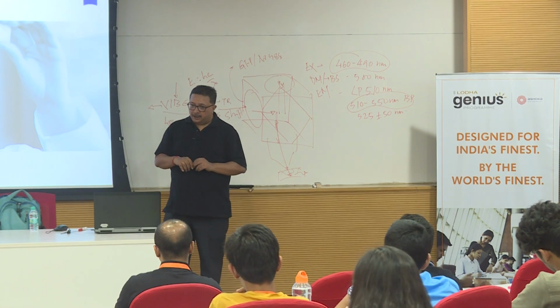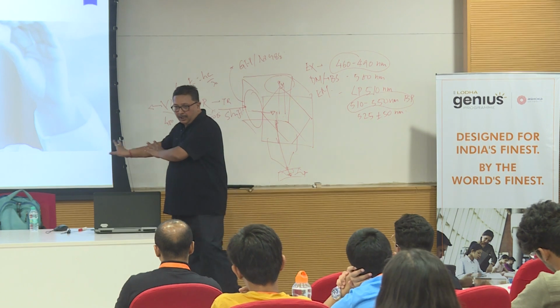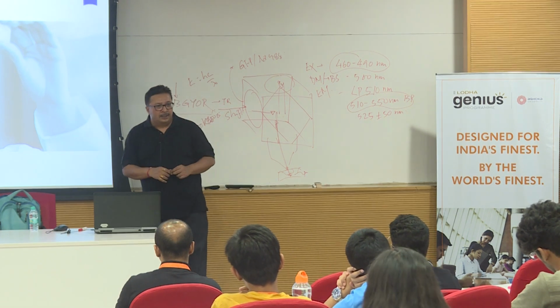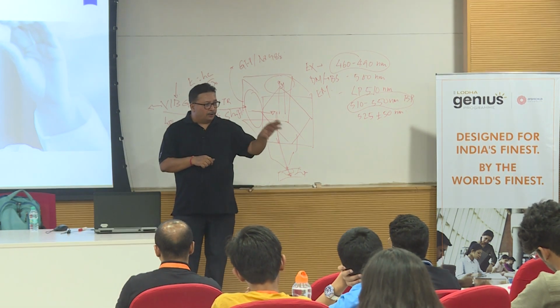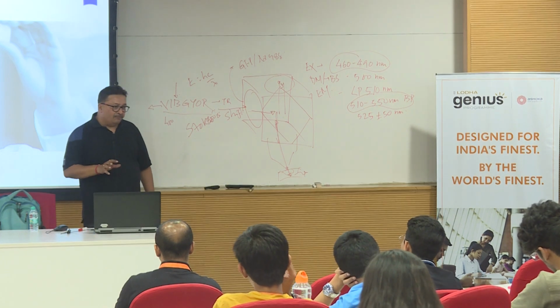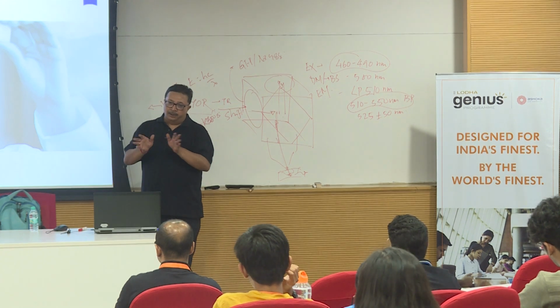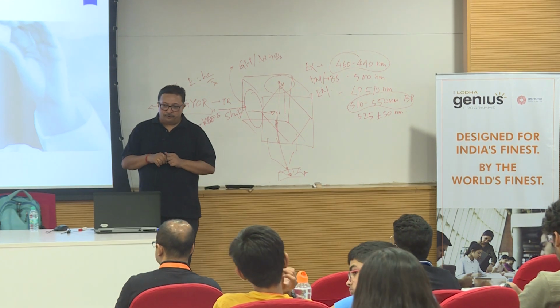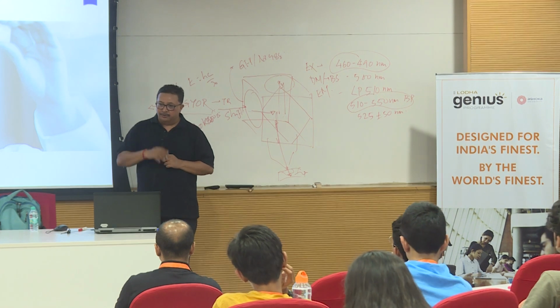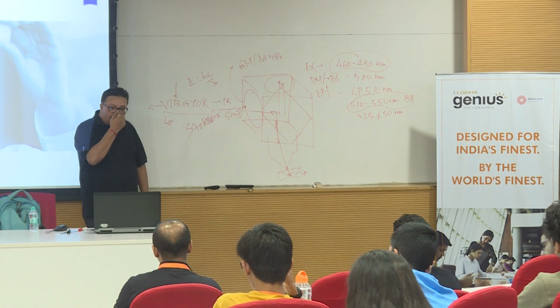It's nothing but some additional properties, some additional aspects that get into the system that convert a fluorescence microscope to a confocal. And every system will come with its advantages, and it also will come with its own disadvantages. In a confocal, for every advantage, you will have a disadvantage. So what does confocal microscopy look like?